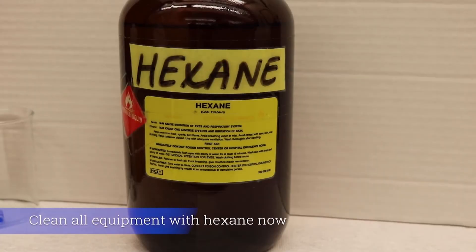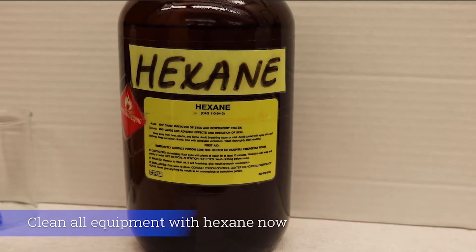Once the equipment is properly washed with polar acetone, perform the last rinse using hexane as the washing agent. Due to its nonpolar and hydrophobic characteristics, hexane is used to minimize the amount of water residue. This step is especially important if you are washing the glassware the day of the experiment.